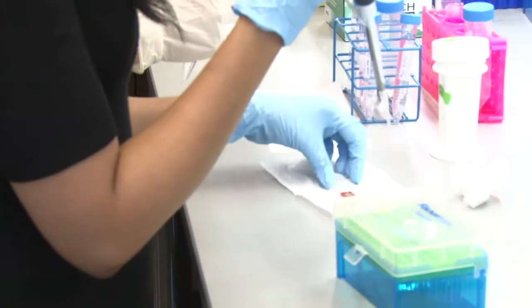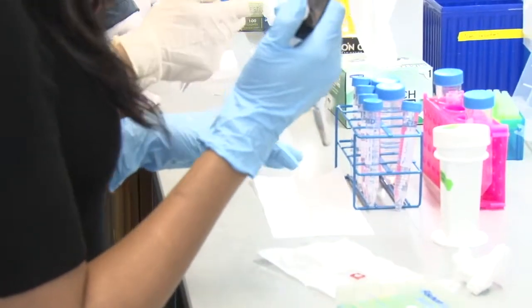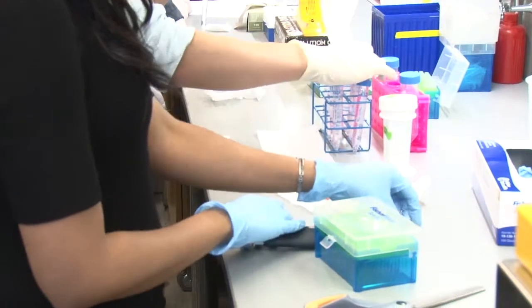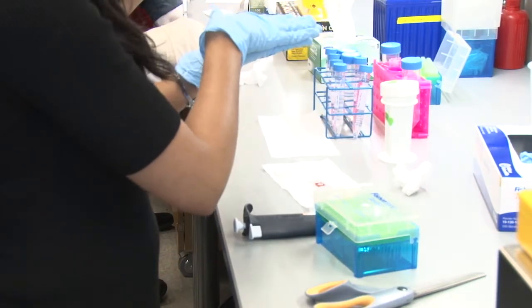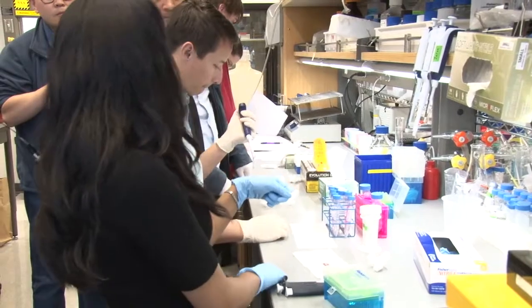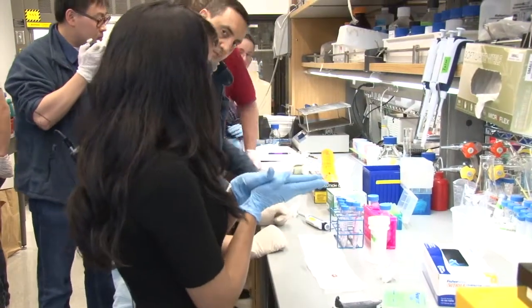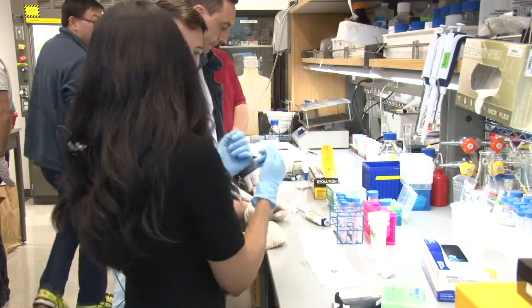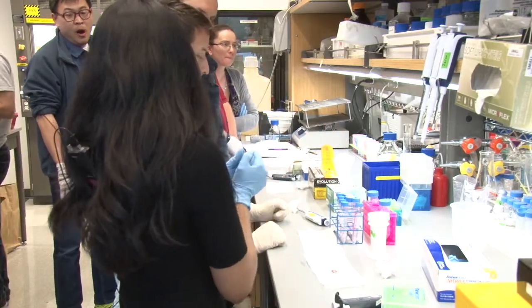Once you add your hybridization probes, you would incubate this in a humidified chamber at 37 degrees Celsius for about two hours. The setup we have here is a Hybe oven, which has a tray and blotting paper — it keeps the tray humidified so you don't want your reagents to dry out, because we're not sealing these ports. If you don't have a Hybe oven, you can use a box where you add wet tissue or water below and place a slide above and seal it.